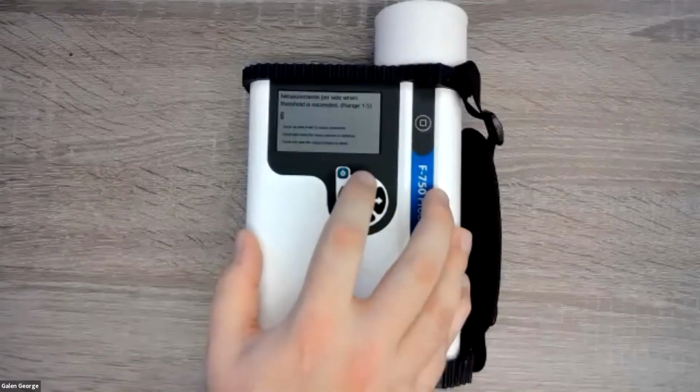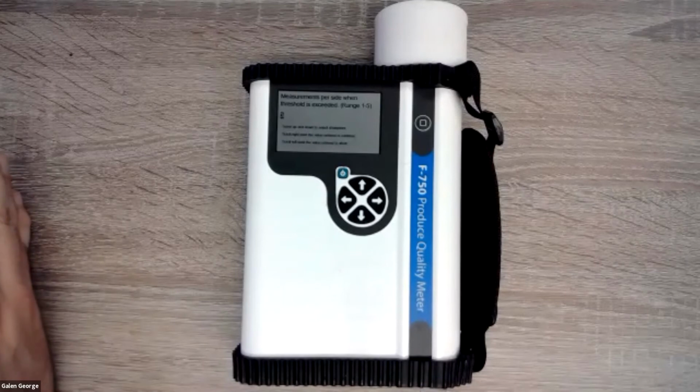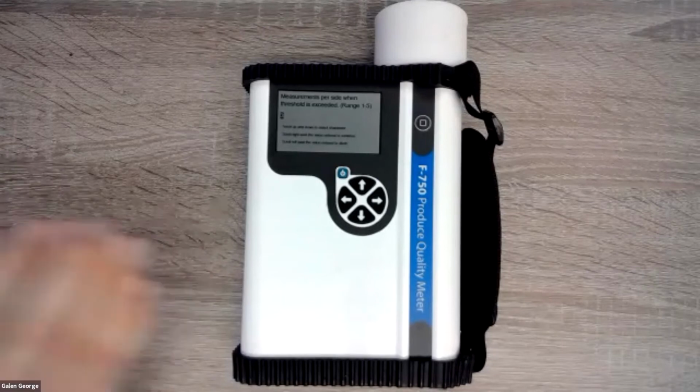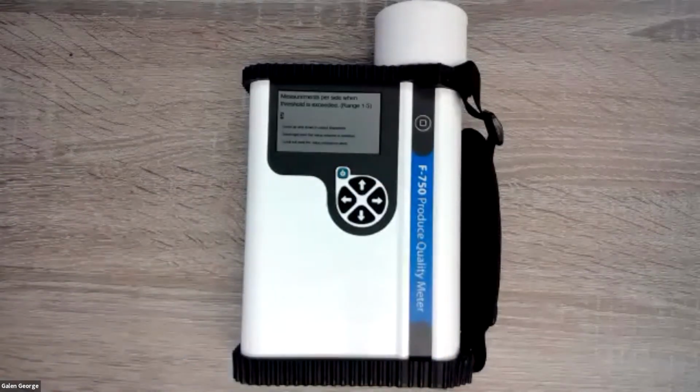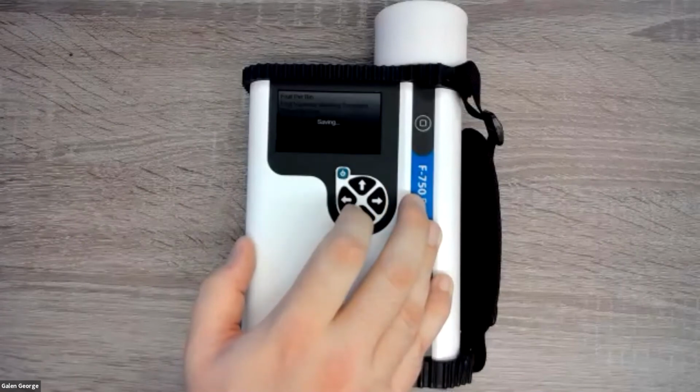Maximum measurements defines that if you aren't meeting the variance threshold, then you can continue to take scans. But there's a certain limit where you might want to say, past this number of scans, we want to start over and rescan the whole thing. Increasing the number of scans might increase accuracy, but if there was 1 bad scan in those 3 that really changed the average and increased the standard deviation by a lot, you might not be able to bring that standard deviation back down just by adding additional scans. So that's what the maximum scan value is for.